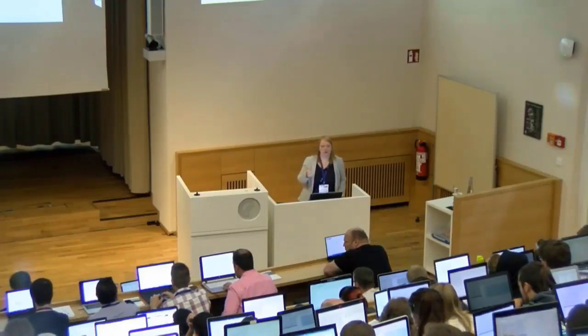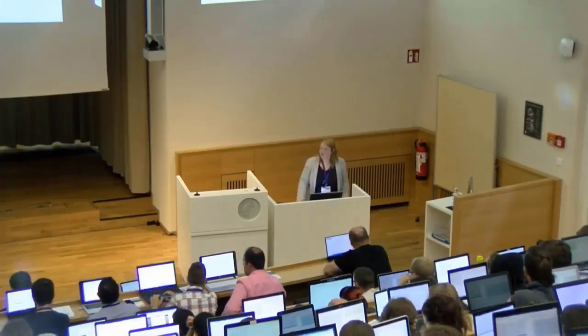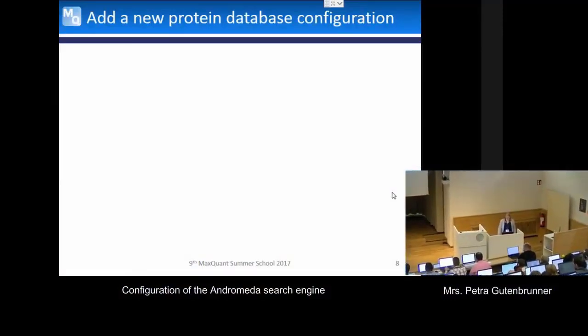So are there any other questions? Okay. So now we are at the point where I think it's also the last assignment, where we want to configure a new protein database.